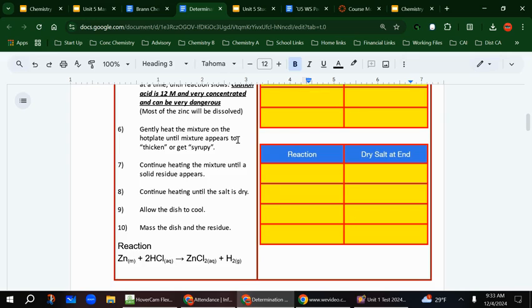I would recommend wearing aprons in the back of the room because if the acid gets on your clothing, it will make a hole in it when you go to wash them. Do not handle the acid any more than you have to. All you have to do with it is take and put it into the tray, the dish that is already on your hot plate.